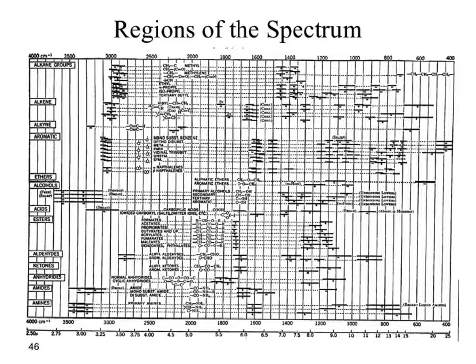These should be quick interpretations. The reason why we need to be quick, let's just look at 3,000 down. What I just boxed in, what happened with our functional groups? We have alkanes, alkenes, alkynes, aromatics. Arguably, even our alcohols start to touch into that. In that exact same region, we get 4 or 5 different functional groups.